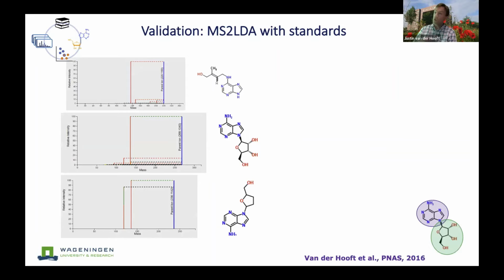We also did validation using 5,000 GNPS spectra and 2,000 MassBank spectra. And I want to let you know, 5,000, that was all there was back in 2015 when we started that process. Nowadays, 7 years later, I think we are nearing 500,000 annotated spectra in GNPS, of roughly 22,000 unique molecules. So I'll give you a few seconds to think about that. I will come back to it at the end of this short primer.